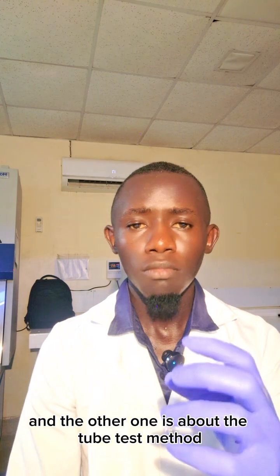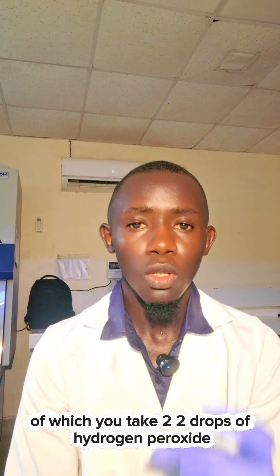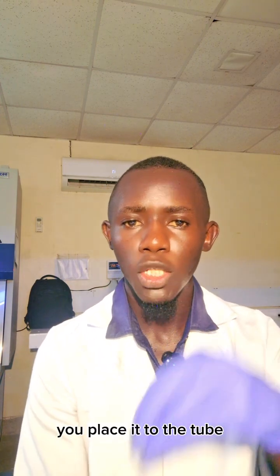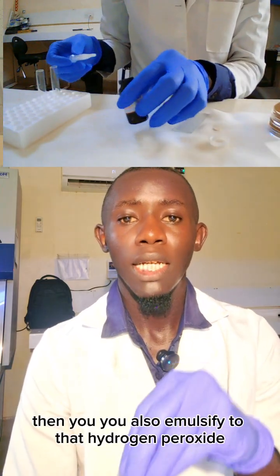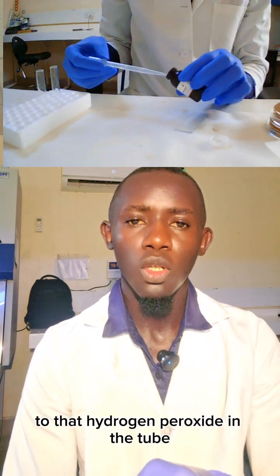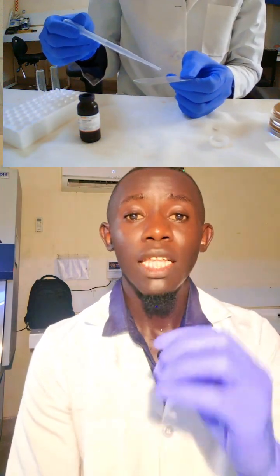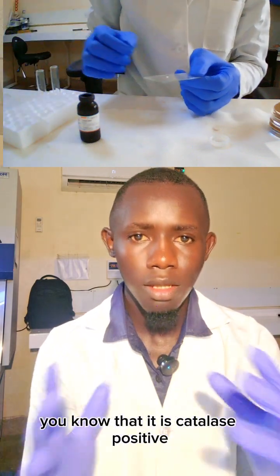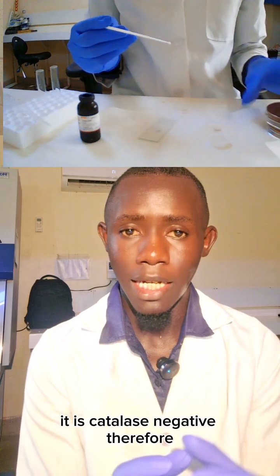The other one is the tube test method, of which you take two drops of hydrogen peroxide and place them into the tube. Then you take 2 to 3 colonies and emulsify them in the hydrogen peroxide in the tube, then you observe the reaction immediately. If there is effervescence, you know that it is catalase positive, but if there is no effervescence, it is catalase negative.